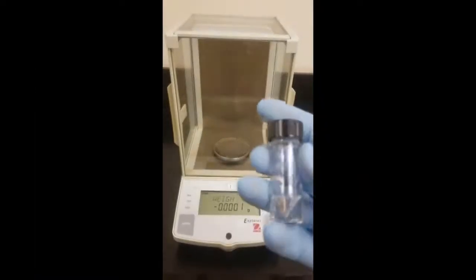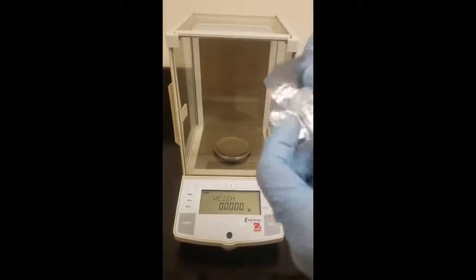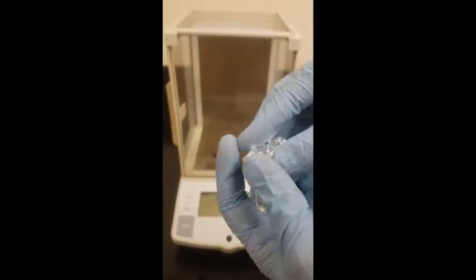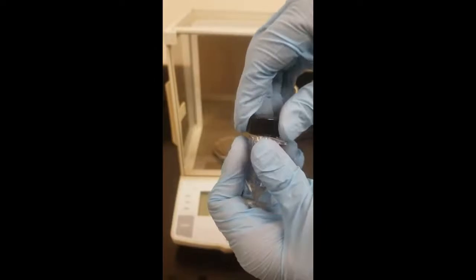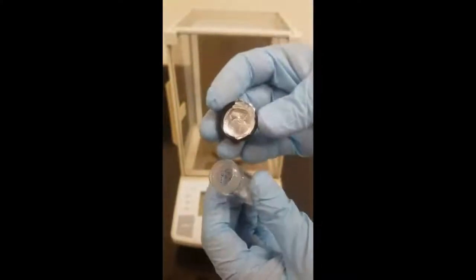All right, so I've got my clean 5 milliliter conical vial right here with a screw cap attached. First thing I'm going to do is add a piece of aluminum foil onto here just to protect it from any contaminants that the cap might have. We reuse these caps, so they might have some kind of gunk on there. So let's take some foil, cover up the lid, put the cap on, rip off some of this excess, and it'll go with the cap when I take it off.